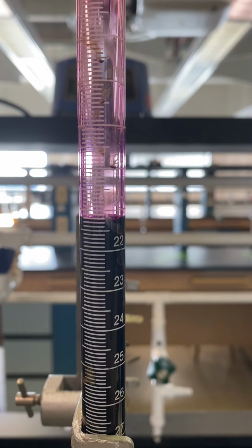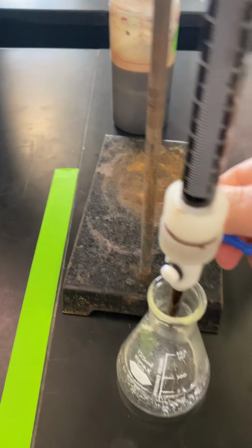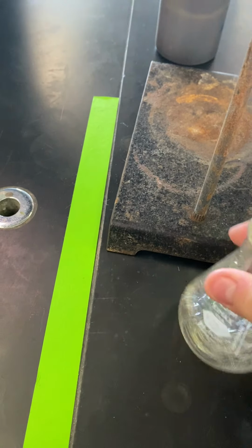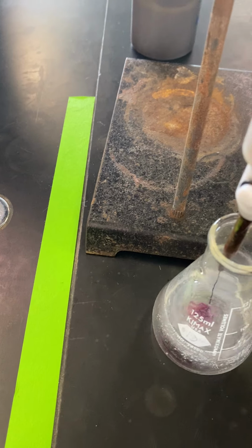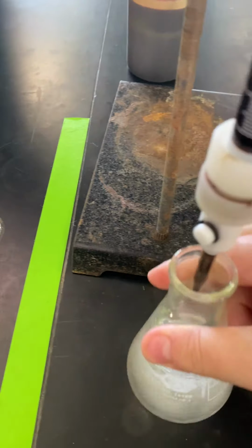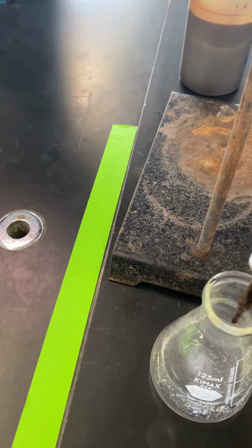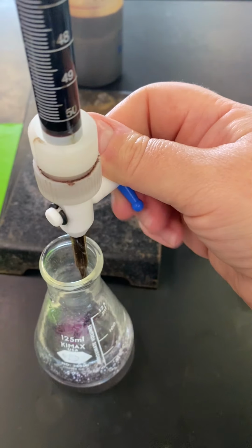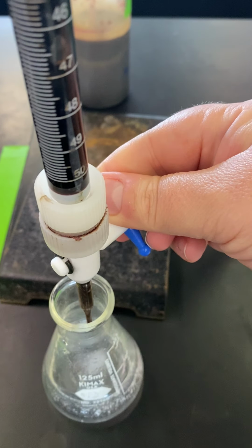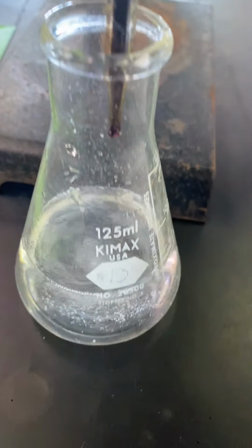See, I've already dropped down below 21 milliliters, so that means I've already added close to 20 milliliters of solution. I happen to know, just from doing this experiment for the last 3 weeks, that I am getting somewhat close to my endpoint. I don't know if you just saw that, probably not, because my hand was in the way. So instead of just squirting a bunch in now, I'm going a little more conservatively, doing smaller amounts.